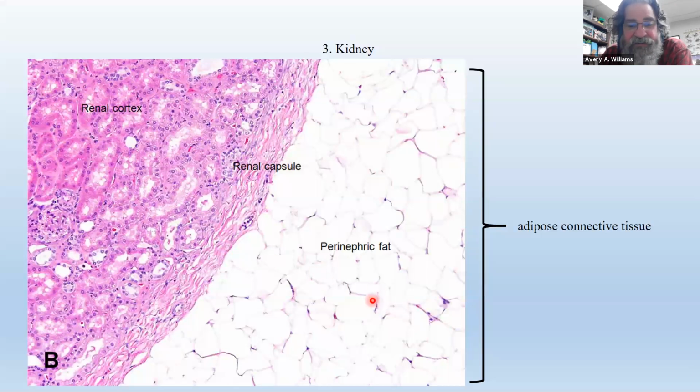The fat with its adipocytes, of course, insulates against heat loss, but it also insulates against mechanical trauma. So it's mechanical insulation around the kidneys. Think about the position of the kidneys: there's no bony armament protecting them. It's a precarious location in your lower back. It's basically the same position in all vertebrates, in that lumbar region. And in mammals, in the lumbar region, there's no bone, there are no ribs. So the kidneys are packed in an adipose capsule, which here they call perinephric fat. And so there you go.